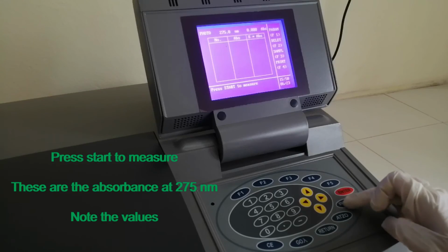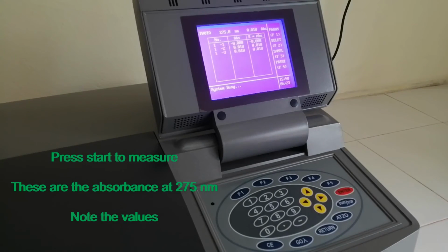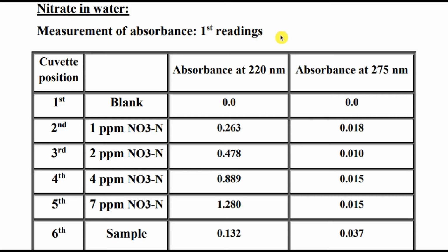Press start to measure. These are absorbances at 275 nanometer. Note the values.